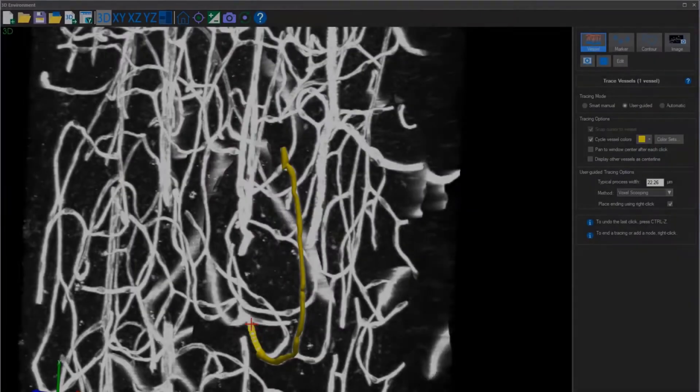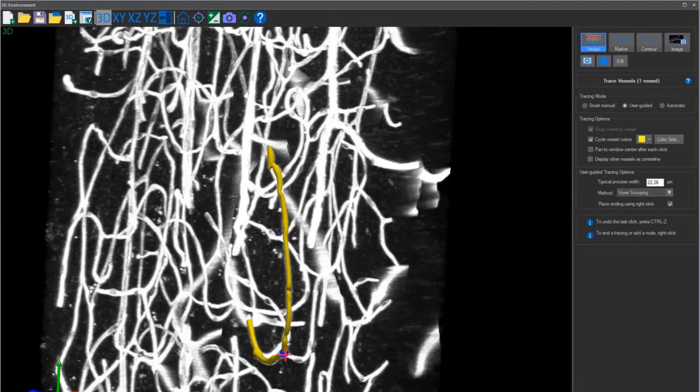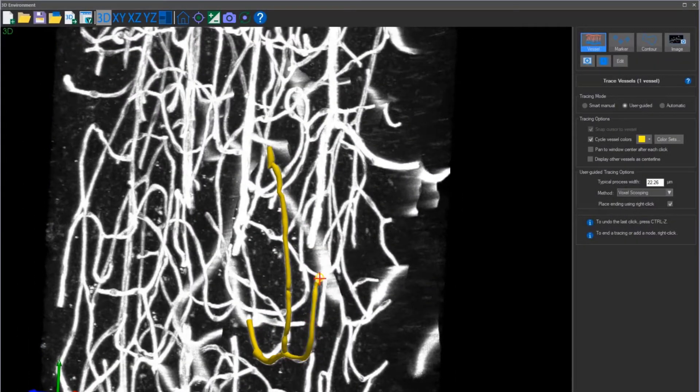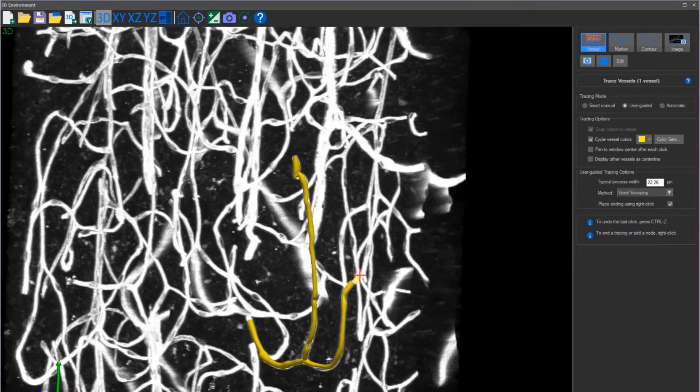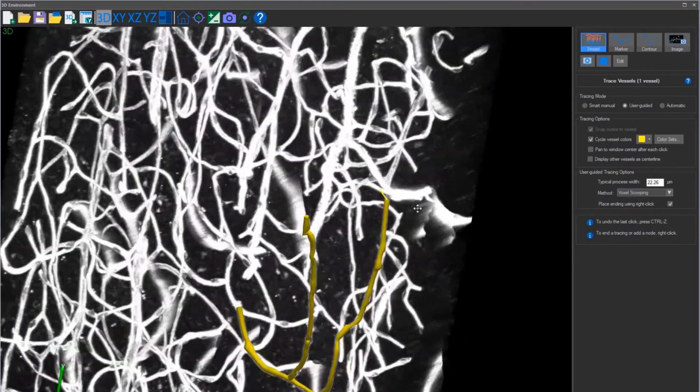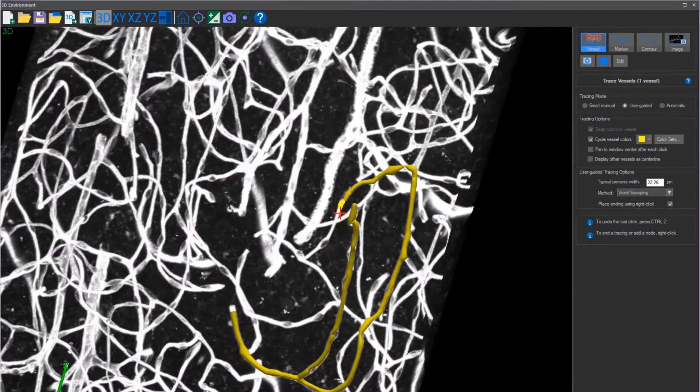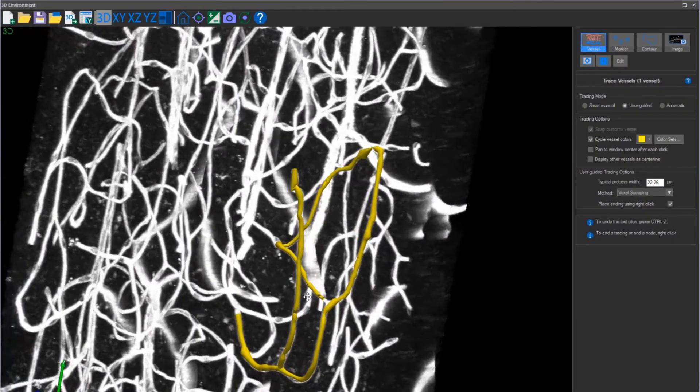If you prefer more control, try the user-guided tracing system. Click to begin your tracing. When reconstructing in a 3D environment, it is up to the user to find the best area to start the reconstruction. Create your first loop and then move on to the rest of the image.